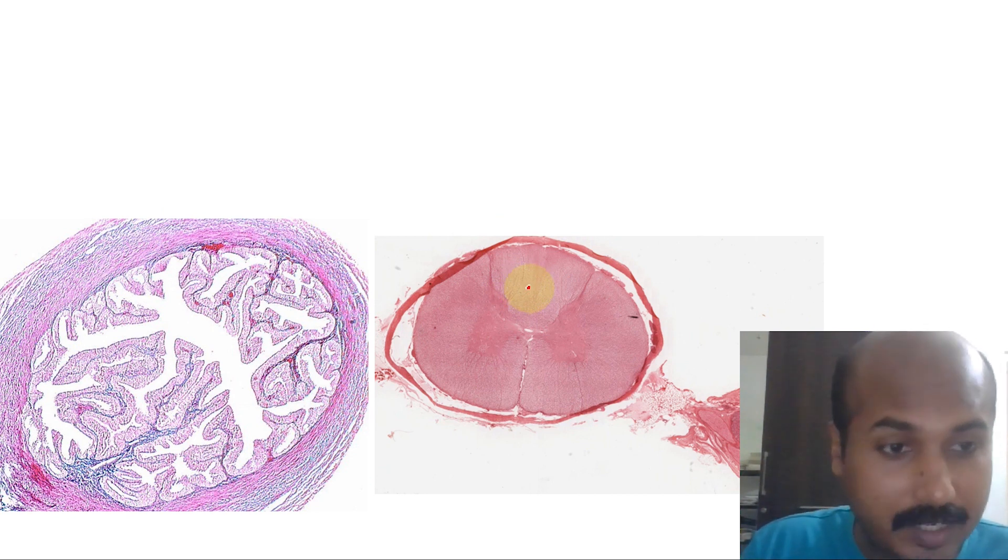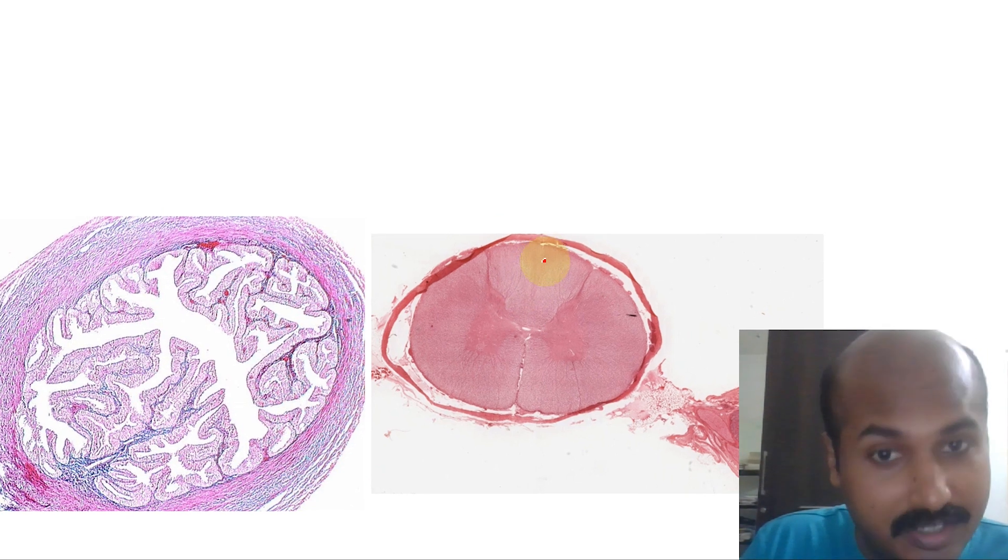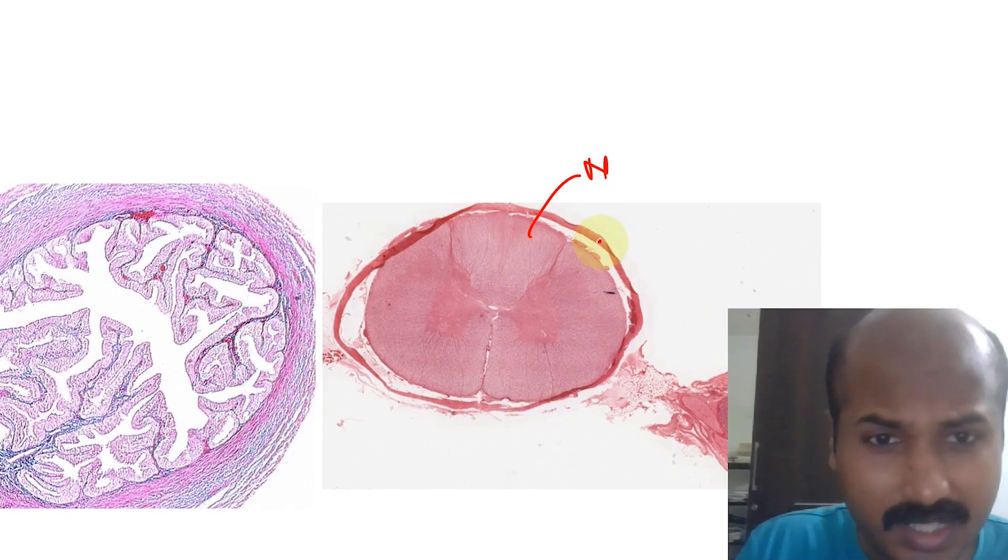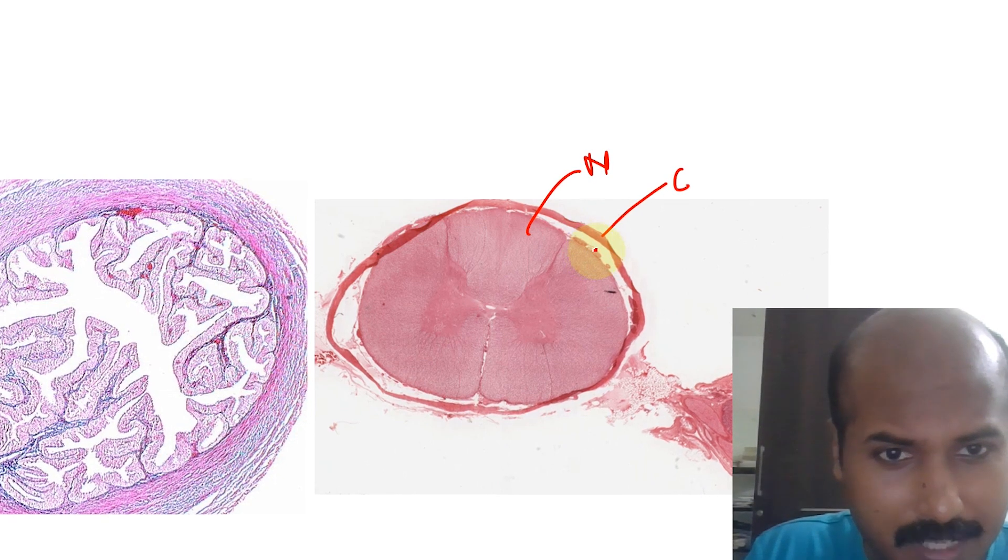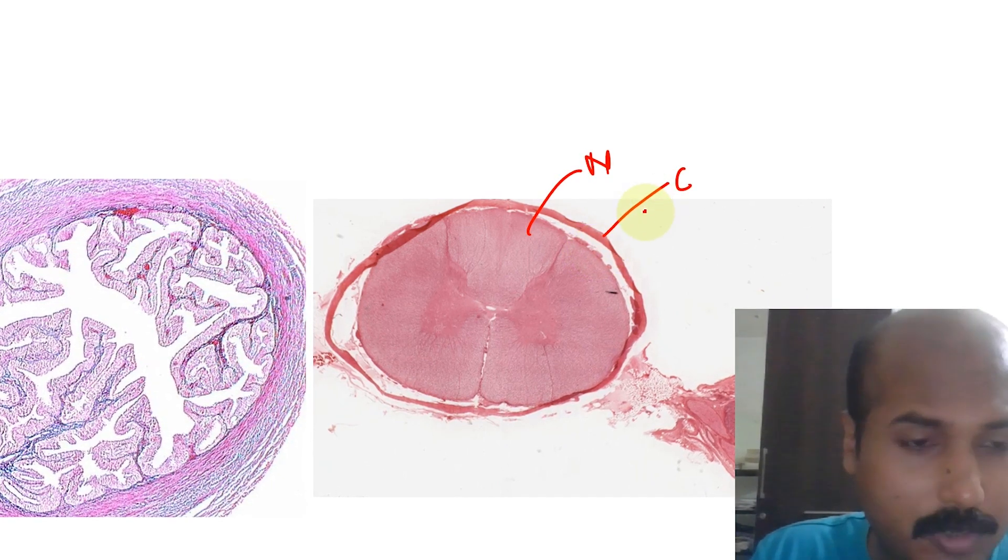If you take spinal cord, it contains mostly nervous tissue. All this is nervous tissue. There's a little bit of connective tissue over here. This is dura mater, this will be pia mater, this will be arachnoid. So that will be connective tissue.